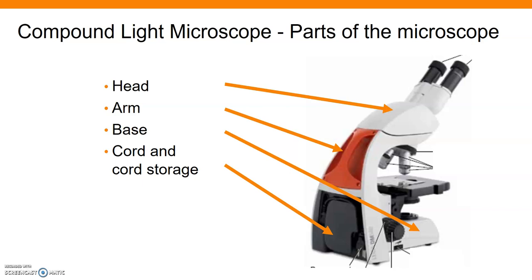Also on the back side here, you'll see there's cord storage and our cords on these microscopes are separate from the scope itself. Here's the plug wrapped around this plastic thing, and right here there's a little other end of the plug and that has to be pretty securely pushed in for the microscope to work. If you ever take your microscope out and plug it in and it's not working, check to make sure the thing is plugged in, but then check this one here to make sure the plug is actually connected to the microscope. It's the number one reason the microscope won't work in the lab.